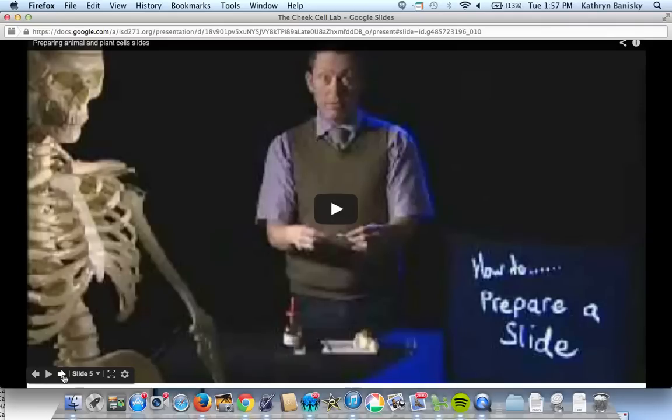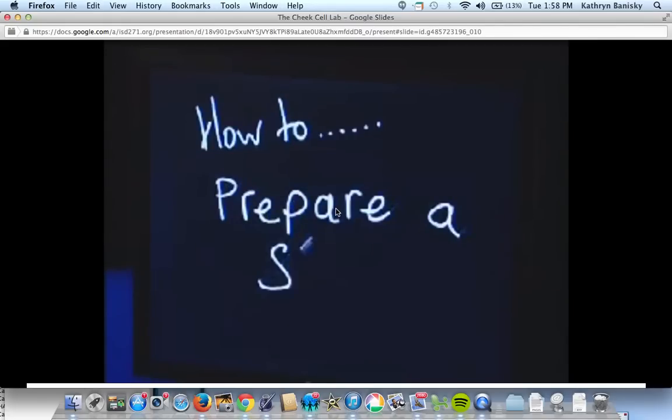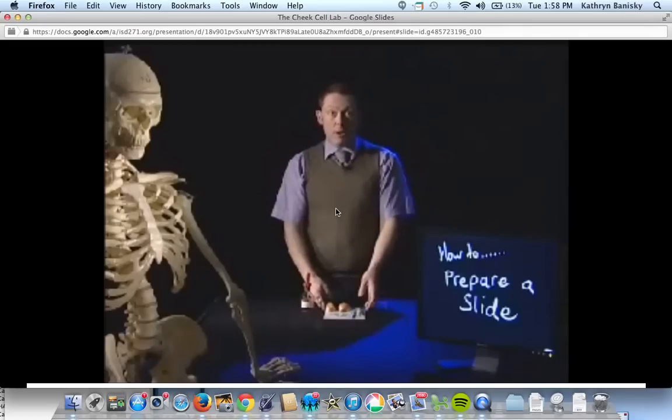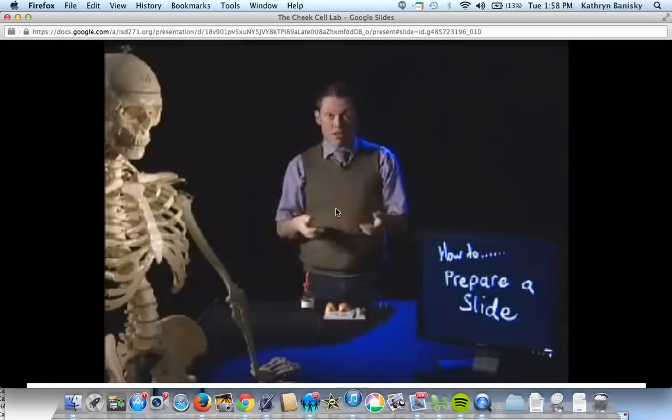Here comes a little video. This guy has a bit of a British accent but you'll be able to hear him clearly. We're going to let you watch how these slides are going to be prepared. As part of your studies, you have to be able to prepare simple plant cell slides and animal cell slides. First, he'll show you how to prepare a plant cell slide. Because the cells are going to be seen with a light microscope, you have to have a thin layer of cells.